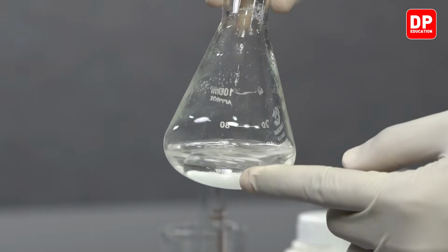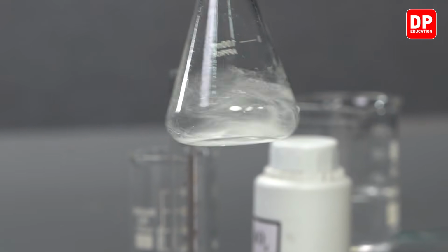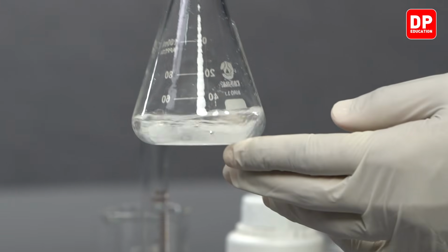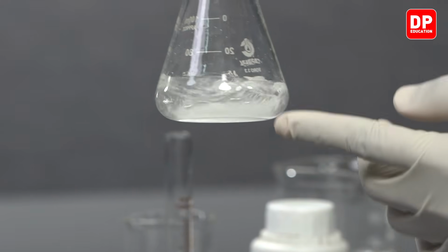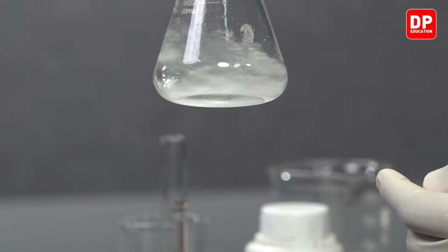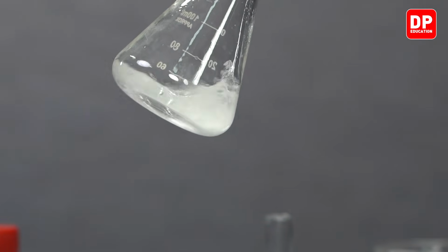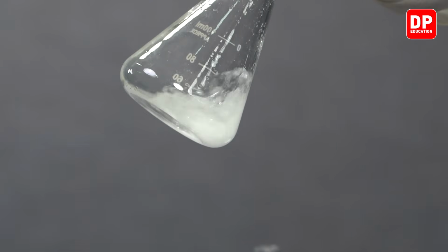And we can see the sodium sulfate is not clumping together. This is indicating that there are no traces of water present in this diethyl ether layer. You do not see any clumps of sodium sulfate formed here.